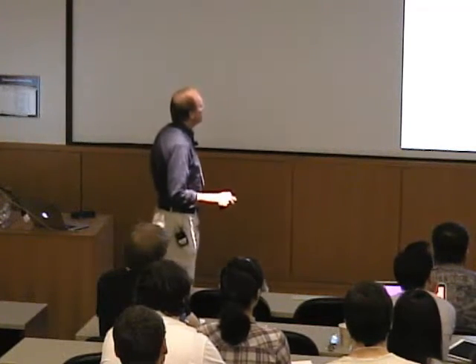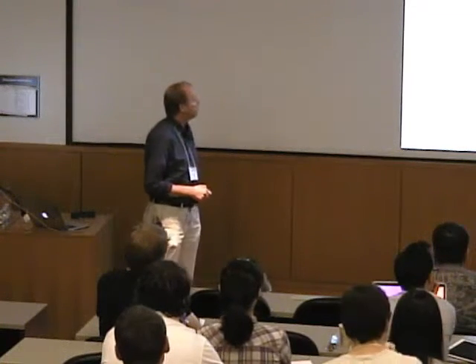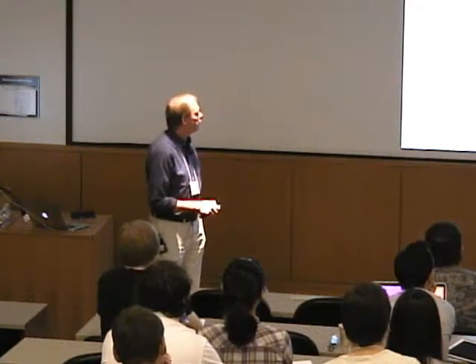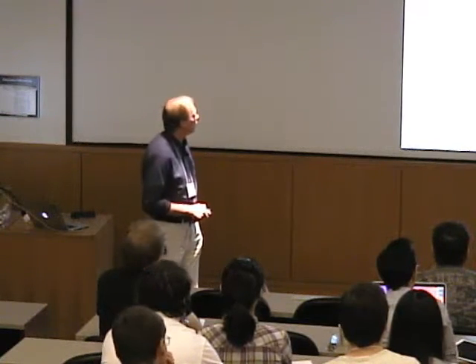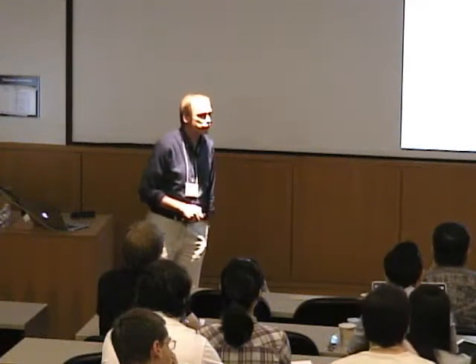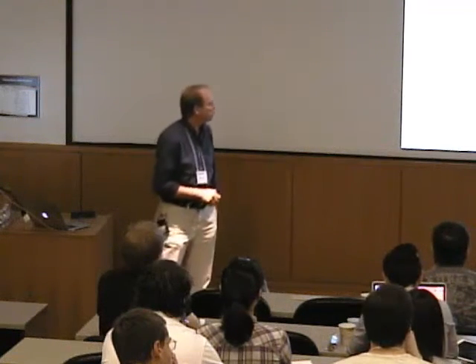And then at the end, we'll talk briefly about high spin systems, where the overall spin is greater than a half. Here, the zero field splitting plays an important role. So we'll talk a little bit about what that is and how we can analyze these sorts of spectra, or at least what determines their shape.